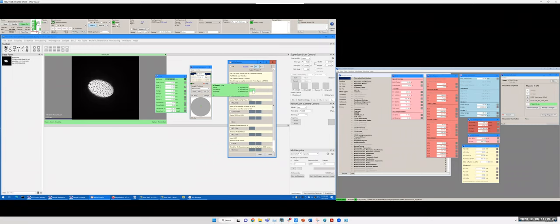So you want to make sure the strength is in the right range. You can make it very small where you don't see any change, then you say, okay, it's good. I increase it by 10, then you can see the effect. And you can see that I want to move it to the perfect condition. You can see now it's moving sideways, but not in a single direction.